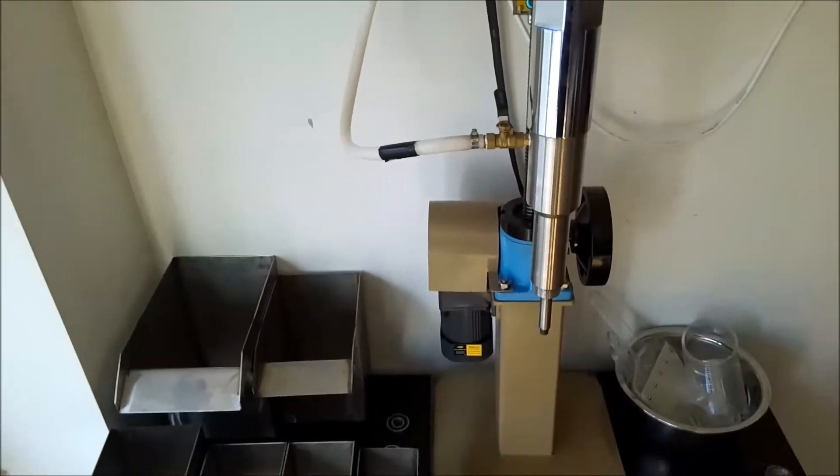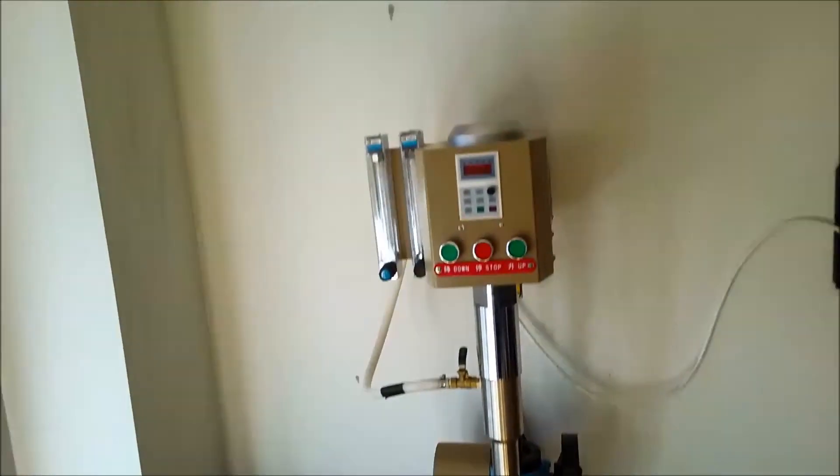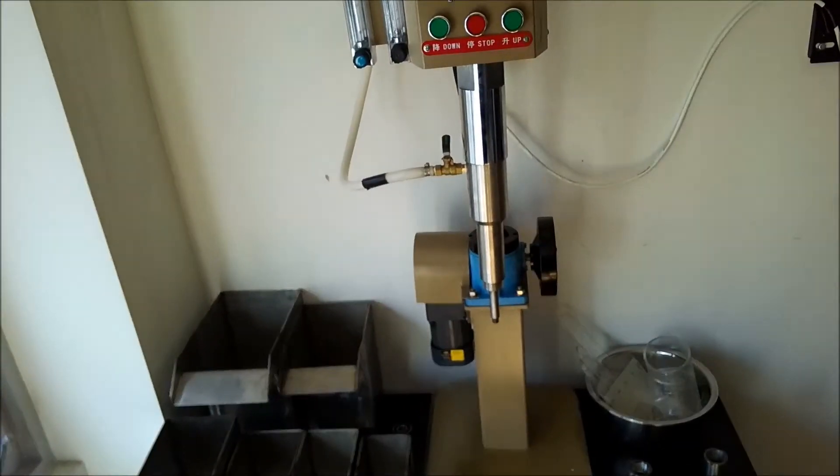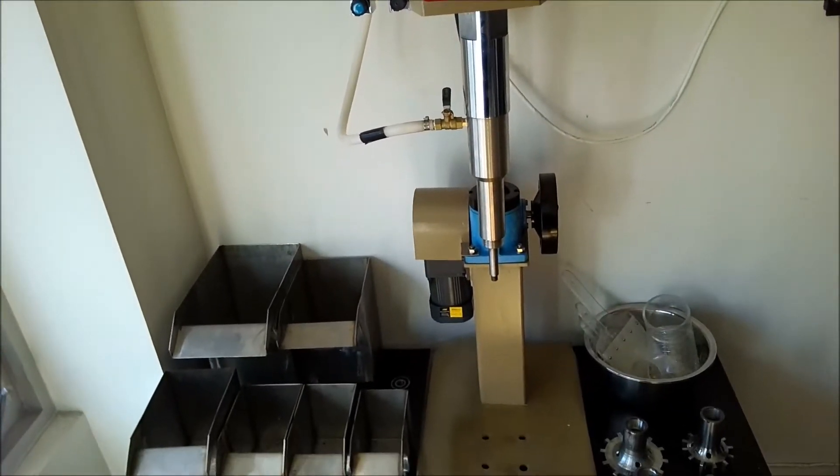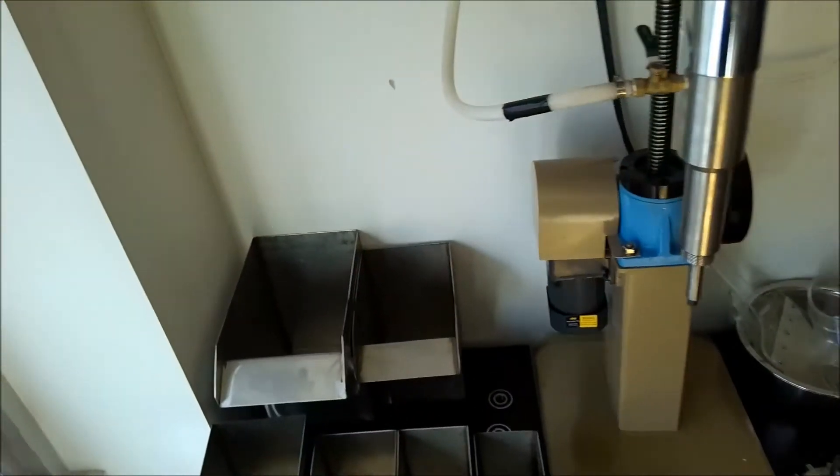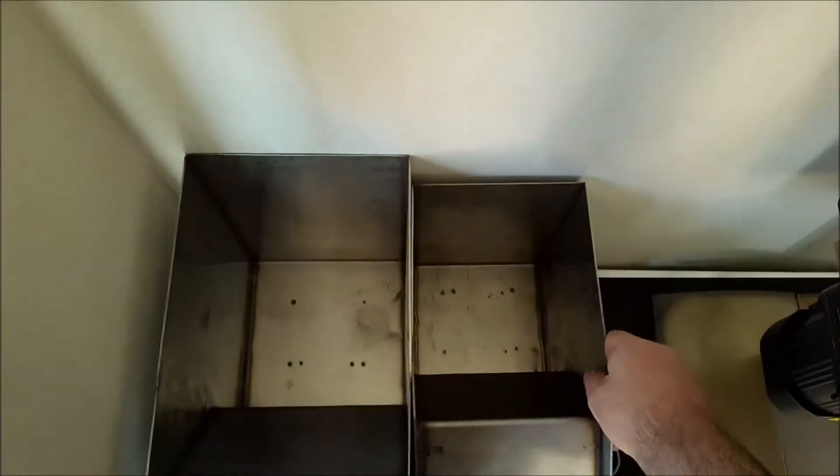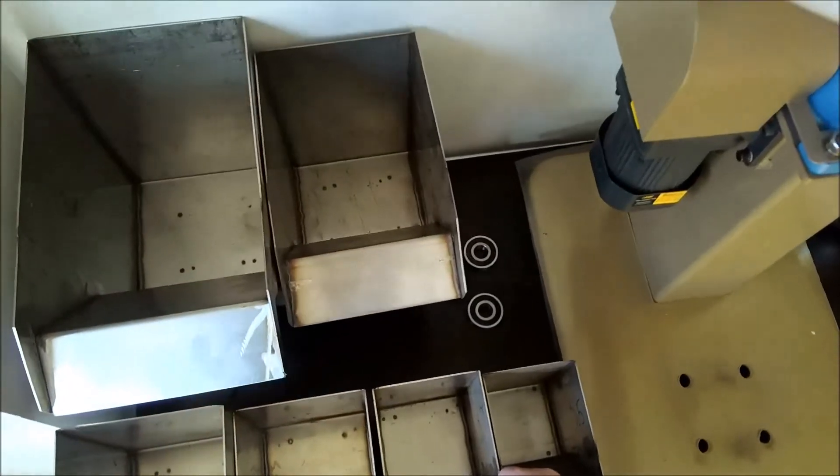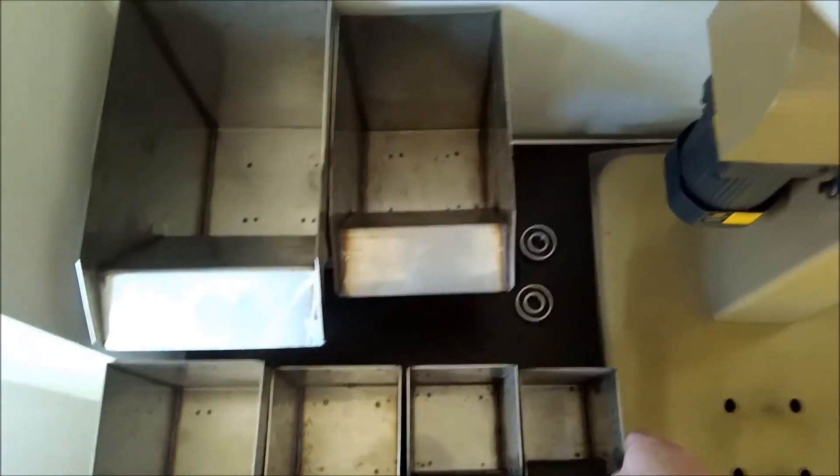Okay, I just unpacked a brand new D12A. That's a D12 knockoff that 9-1-1 Metallurgy sells. You see it comes with an 8 liter, a 4 liter, 2, 1, 3 quarters and a half liter stainless steel tank.